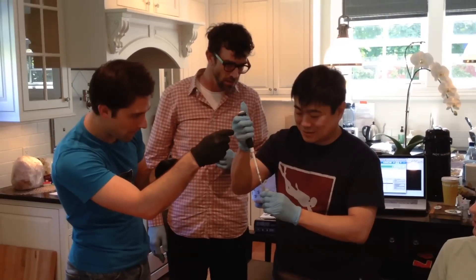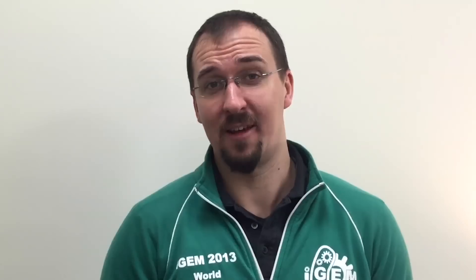As an educator, I really love these types of kits, and I'm looking forward to more of the products that Symbiota is going to develop. I used the Symbiota kit last year with Joey Ito to assemble some parts together. I think it works really well, and we would love to see some teams in iGEM working with it this year.